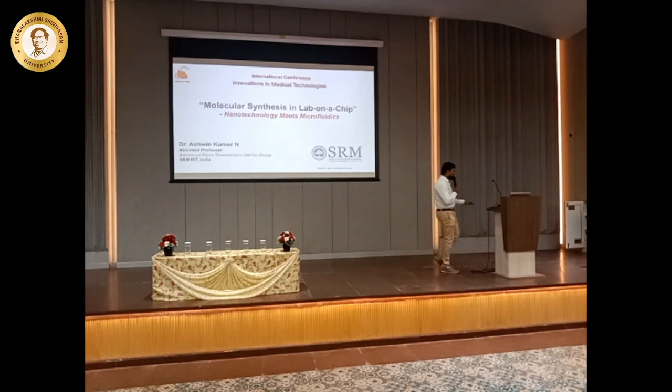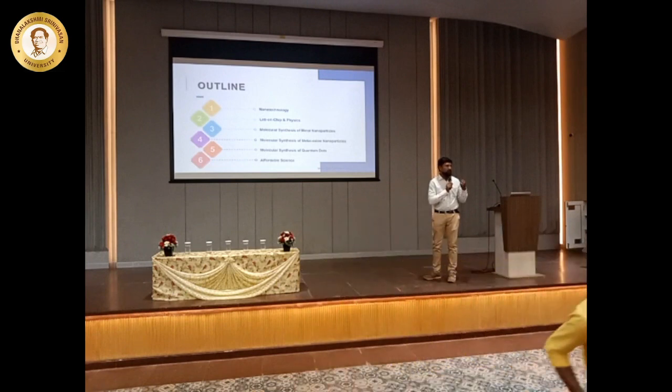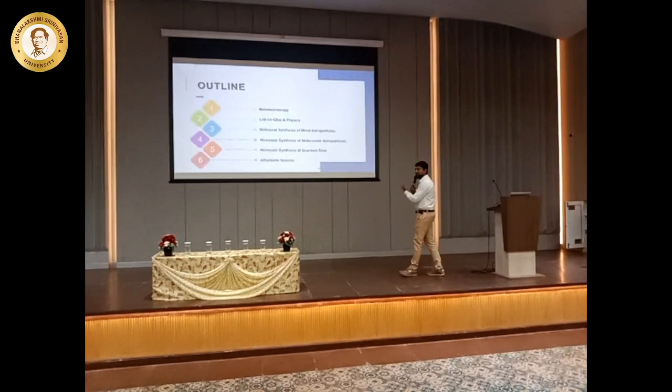So let's see the outline of this talk. First, we'll discuss the basics of nanotechnology. I'm not going to go into details on how we manufacture in bulk, but we are going to see how these nanomaterials can be developed in microfluidic devices. So how lab on chip works, and what the physics behind synthesizing these nanomaterials in lab on chip technologies is, and how we can have different materials like metal nanoparticles such as gold, metal oxides like iron oxide nanoparticles, and also different quantum dots, and how these can be generated in a chip.